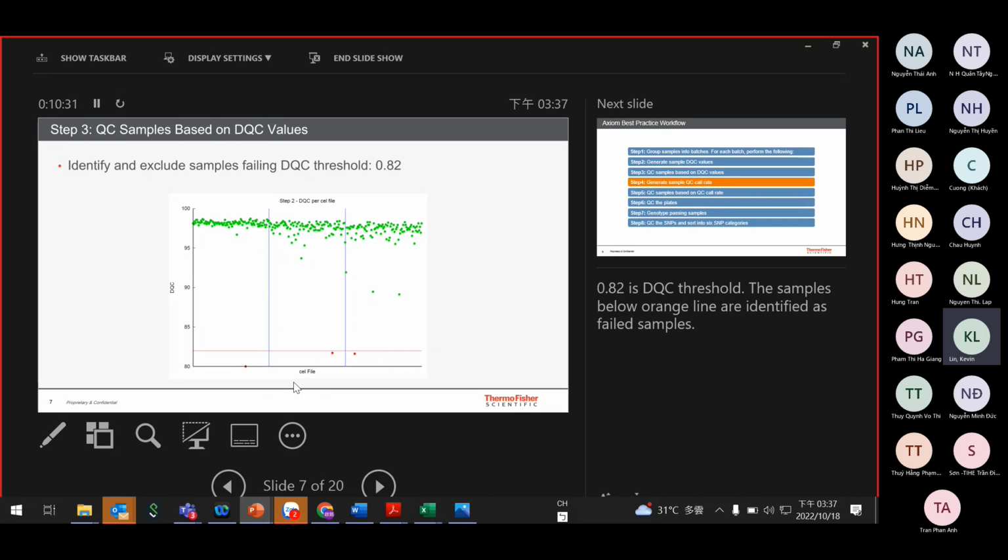Most of the time, if you are familiar with the entire workflow, I would say the pass rate would be almost 100%, but it depends on the quality of the DNA. If you have blood samples, from my experience with customers, the fail rate would be less than 1%. When they process 10 plates, they will sometimes find one sample that may have failed. With 1,000 samples, it's common.